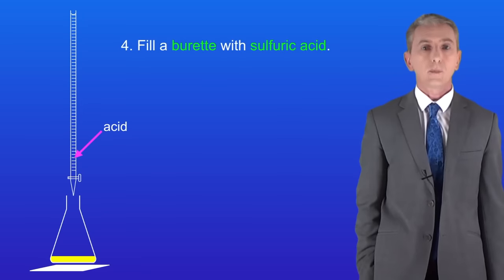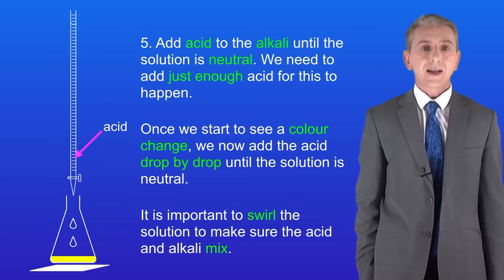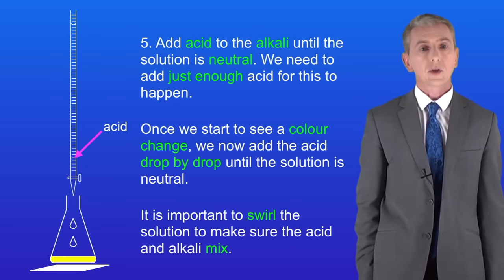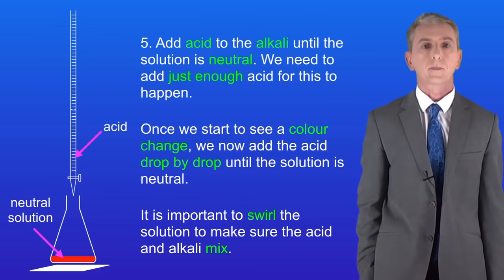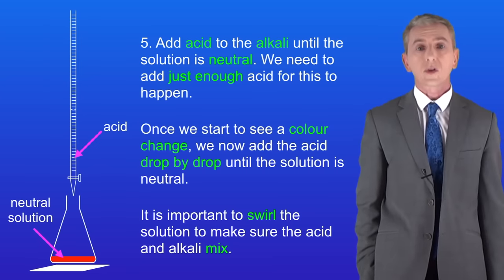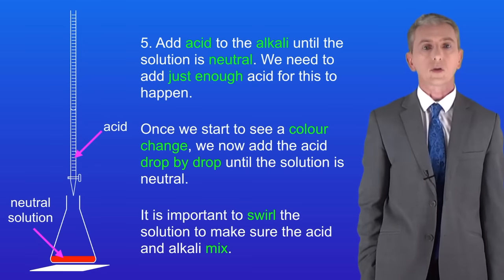We now fill a burette with sulfuric acid. Now we add acid to the alkali until the solution is neutral. With methyl orange the color change will be from yellow to permanently red. We need to add just enough acid for this to happen. So once we start to see a color change we now add the acid drop by drop until the solution is neutral.